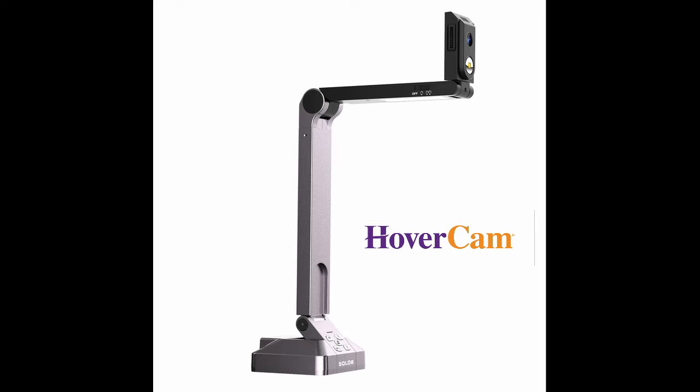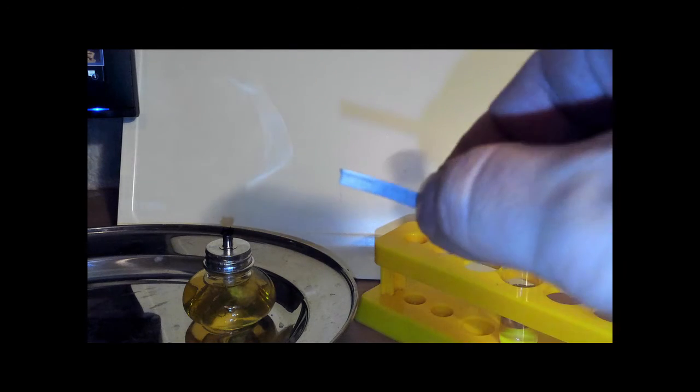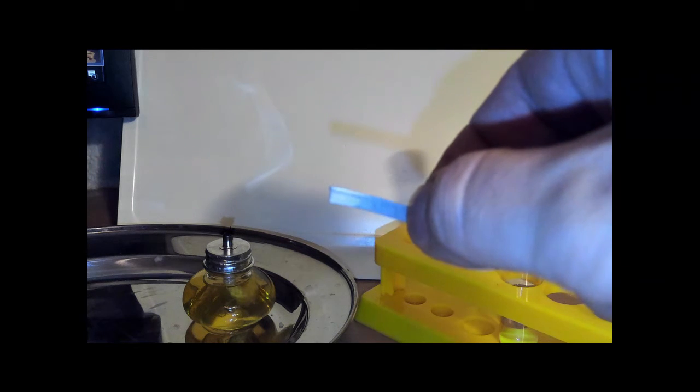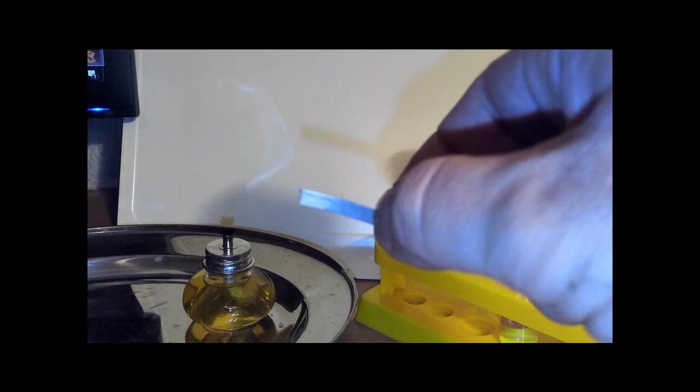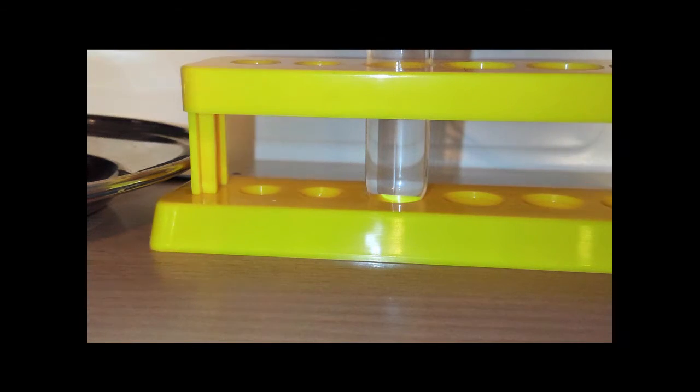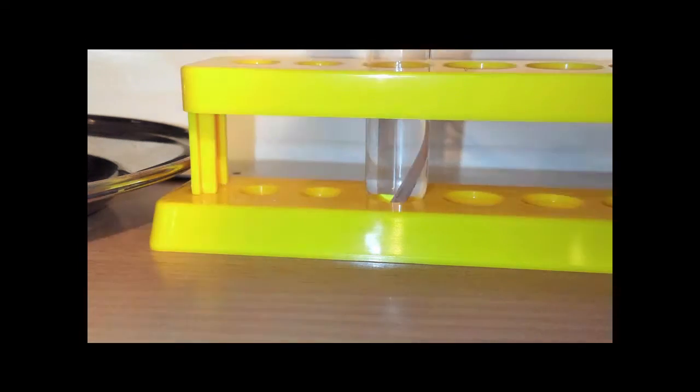Here is my strip of magnesium that I have cut off ready to add to the vinegar in the test tube. Here we are now adding the magnesium strip to the test tube, and you'll see bubbles being given off straight away.